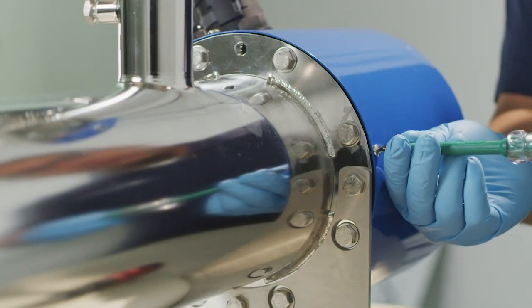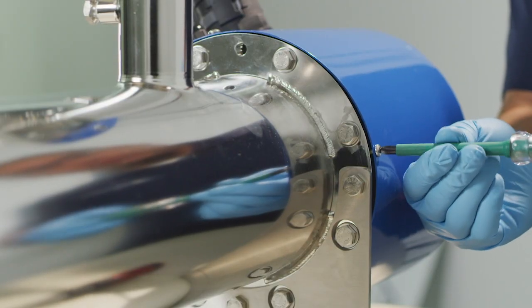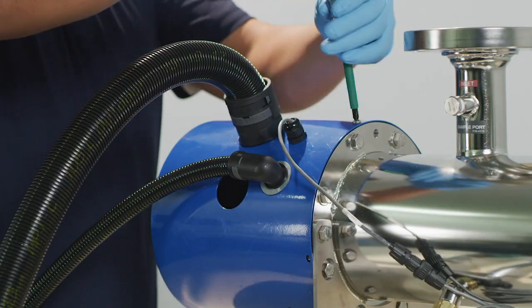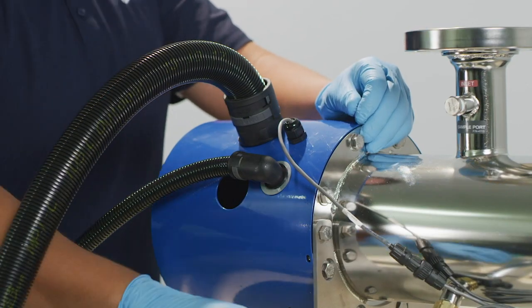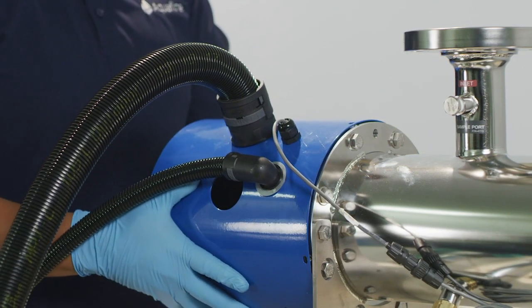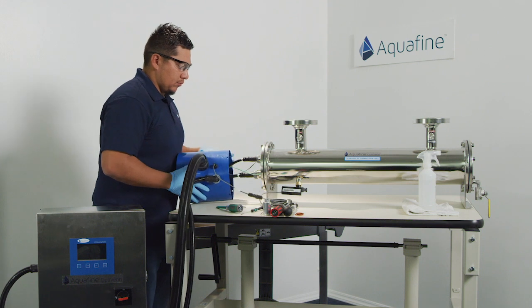start by using a Phillips screwdriver to remove number 10 pan head screws that secure the outer metal end cap. Once screws are removed, pull back on the blue end cap to remove and expose the unit's electrical connections.